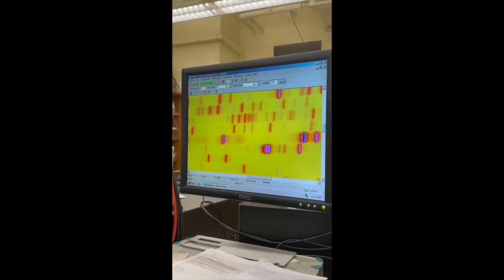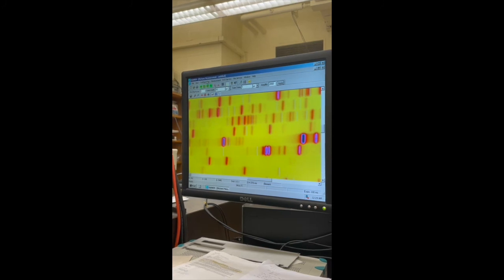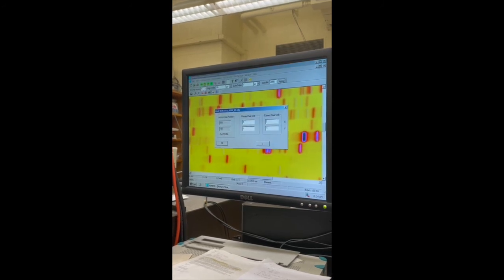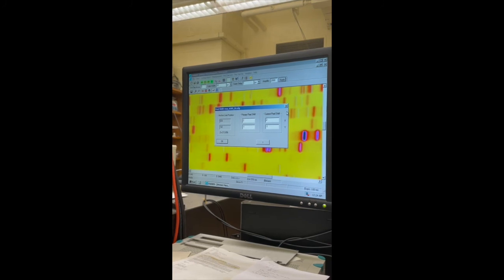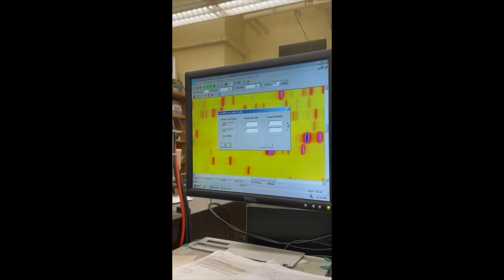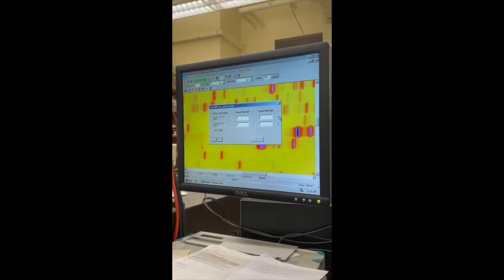Now, Dr. Rehse, if this wasn't properly calibrated, where could I go to fix that? So if you go up to the configuration window, now we're going to a third menu you haven't seen, which we call the pixel shift. So what we would literally do is shift the pixels left or right, or up or down. And left or right is X on the chip, and up or down is Y. In my experience, we never have to touch the Y, but it's not uncommon at all for students to have to change the X pixel shift.